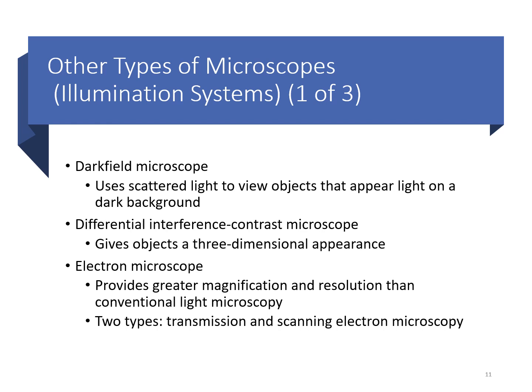You have electron microscopes. This provides a really more detailed magnification and resolution. And then within that you have a couple of different types of electron microscopes, with a transmission and a scanning electron microscope. You're going to see these in more of your larger research type facilities.